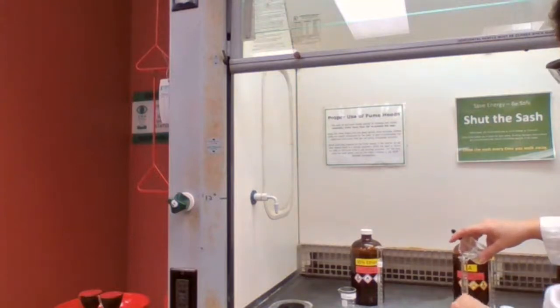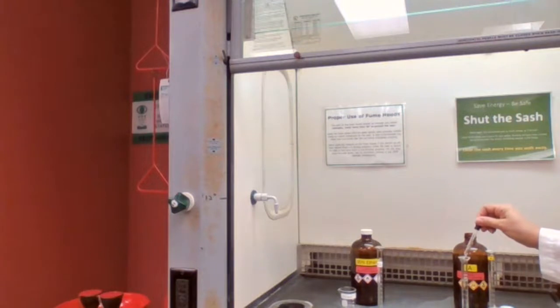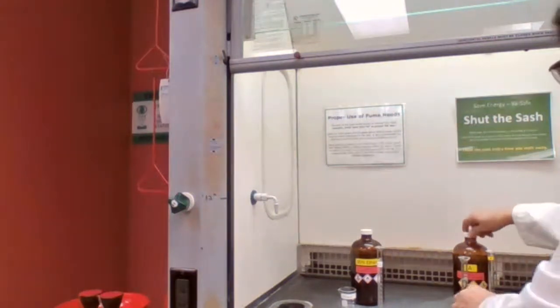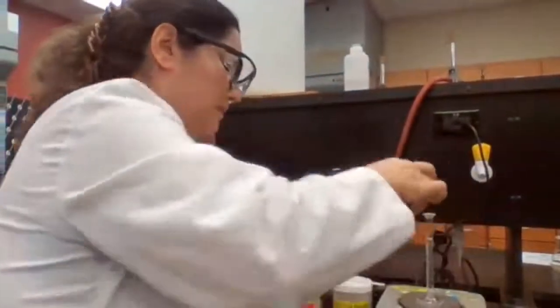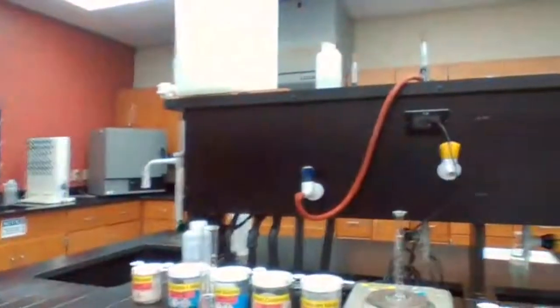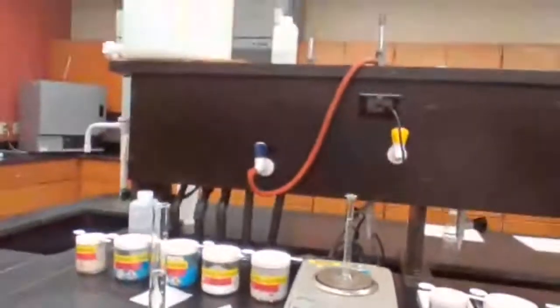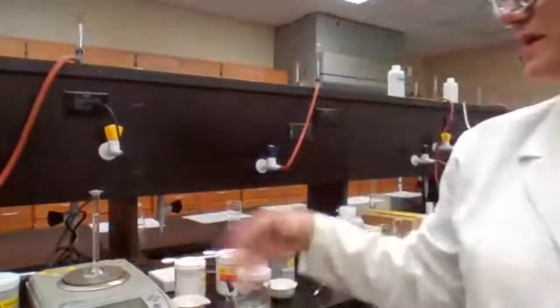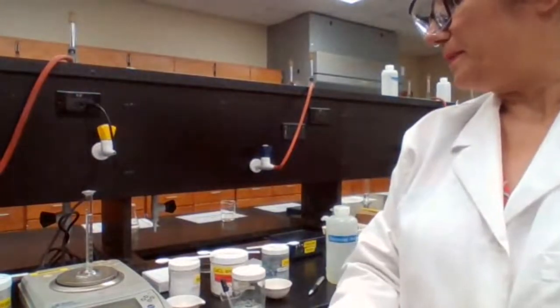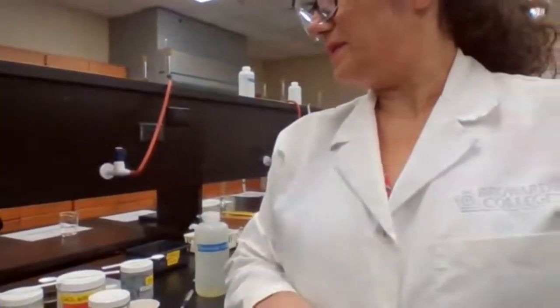So we get 10 milliliters of this sample. Exactly 10. We measure the mass on the scale. Okay. This one now is 45.20. That's the number that is going to be recorded. I'm going to wait for the most stable number because it's fluctuating. Okay, 45.815.